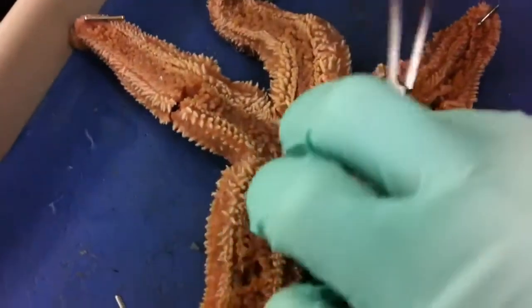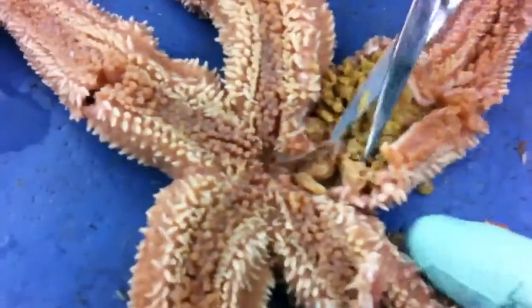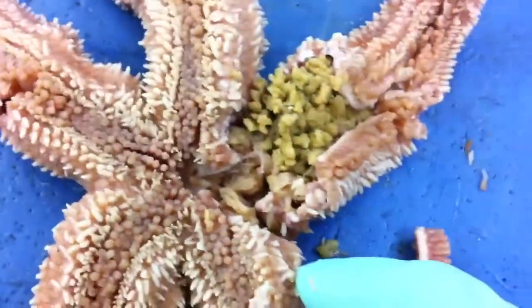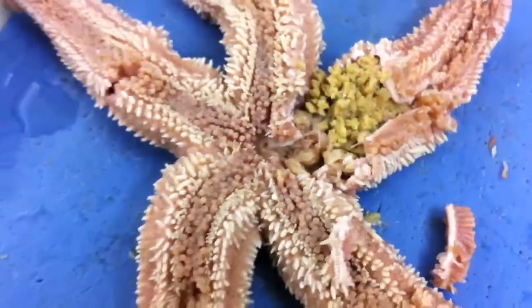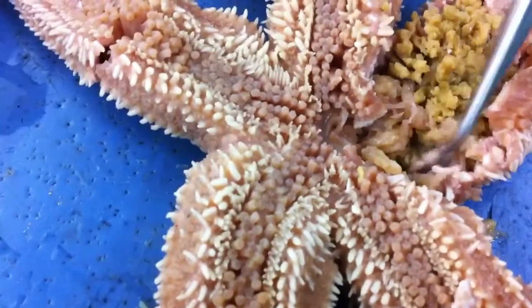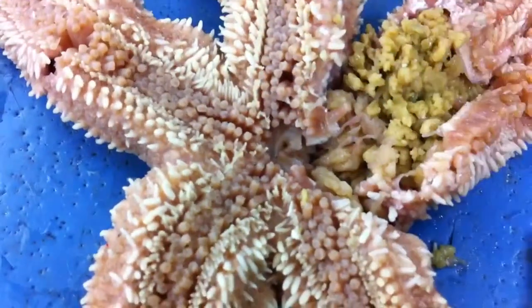So this is the stomach part right here, you can see. This thing right here — this is the stomach, right there. YouTube how a starfish eats. This thing comes out of that little hole and just sucks in and eats it.